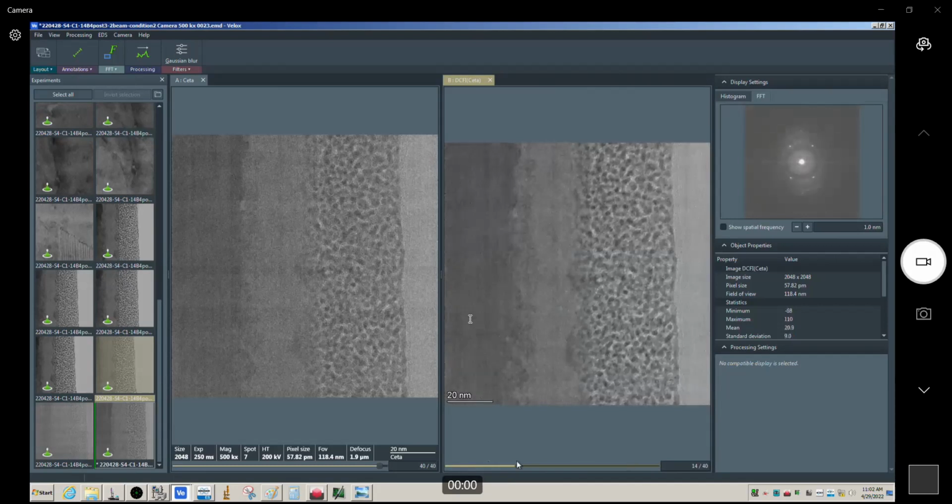So you can actually see at what point your summation starts to go awry. Yeah, see right there, it's still. Huh, interesting. So that didn't quite work as well.